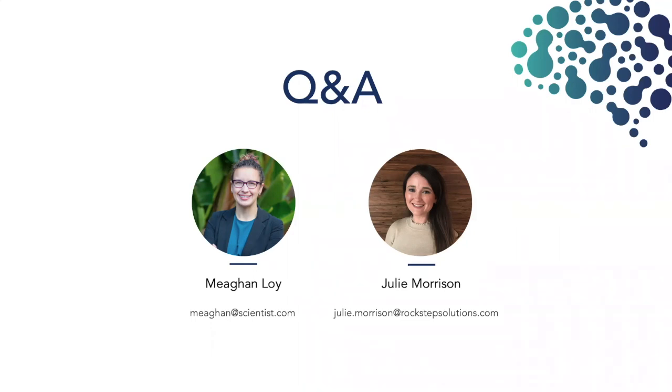Our next one is, do you ever have issues with animal identification when you use paper methods? Do you want to start that one, Meaghan? Sure, I think we can tackle this one together. So yeah, when you're working on paper, it's really easy not only to write down dose times or collection times in the wrong space on those huge grids, but it's also really easy to sometimes misidentify animals. So one of the things that you can implement in the lab is maybe chips or identification. And Julie, I know that you guys have a cool solution for that.